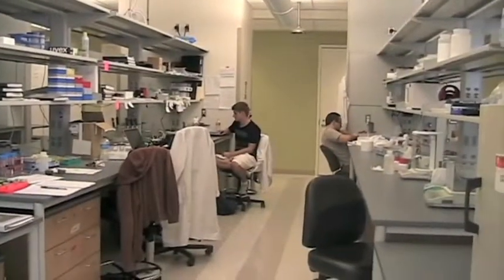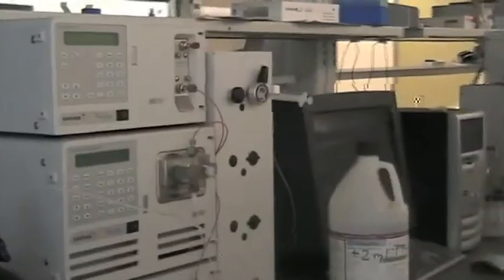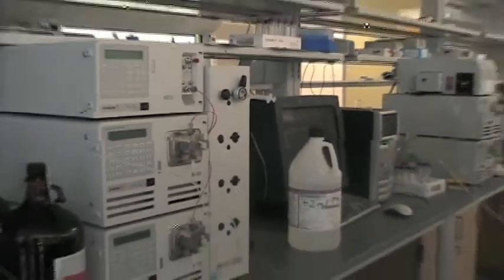These are other people working in the lab, Brennan and O'Hay. That's my bench area where I take notes and carry out my experiments. This is the HPLC which we use in purifying the peptides and also characterizing the peptides.